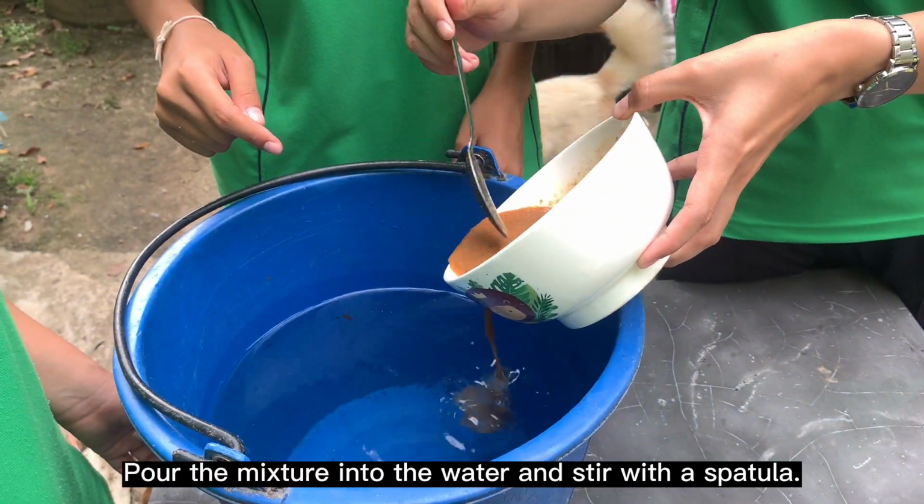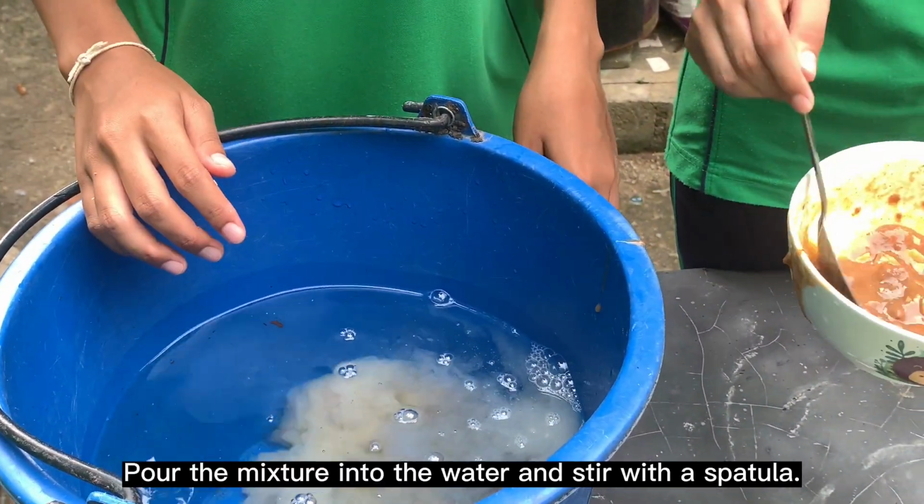Pour the mixture into the water and stir with a spatula.